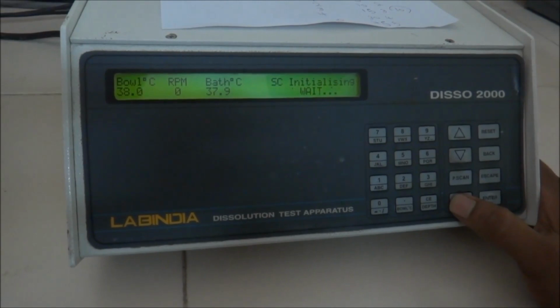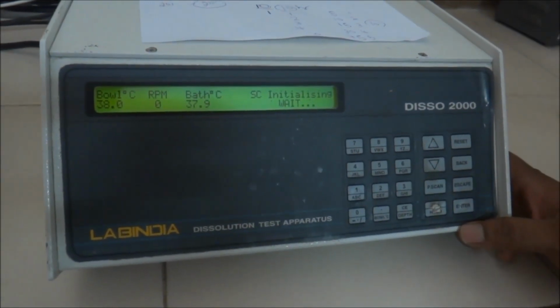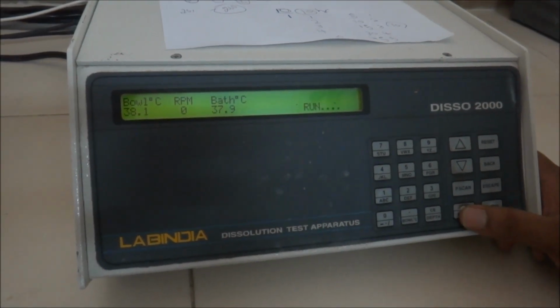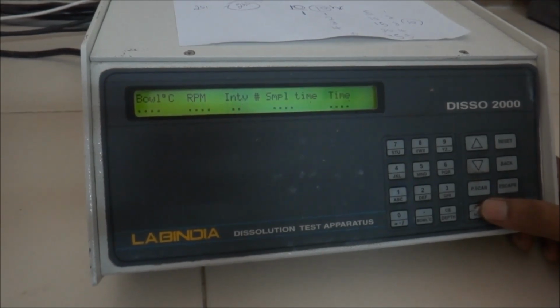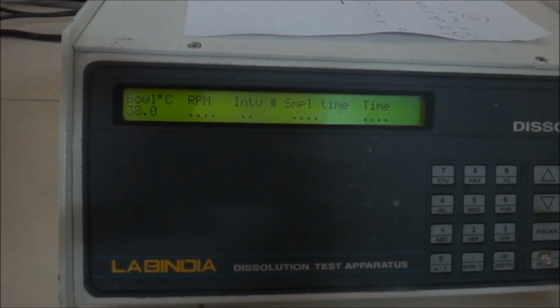That SC indicates the sampling collector, so SC for sampling collector is initializing. It is transferring the program data to the sampling collector. And when the window says run, you can press the hold button and you can see the starting of all the things.